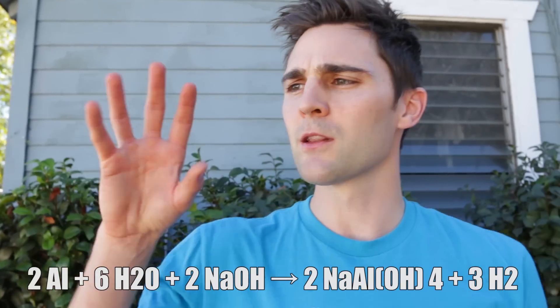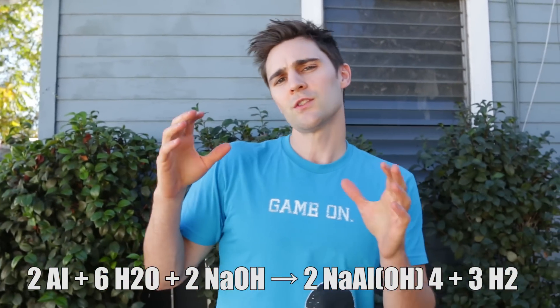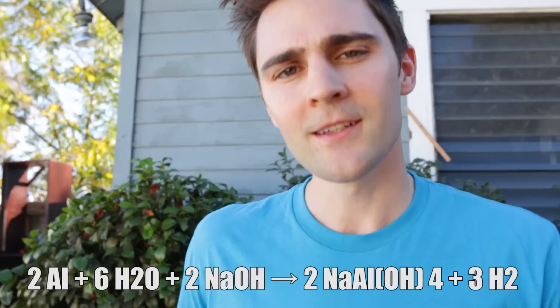Aluminum foil has a little outer waxy coating, and as soon as the sodium hydroxide eats through that, it gets to the actual aluminum. The aluminum and sodium hydroxide come together to create sodium aluminate and hydrogen gas. Hydrogen gas is extremely flammable, so we're going to put that into a balloon and attach it here, then light it and see what happens.